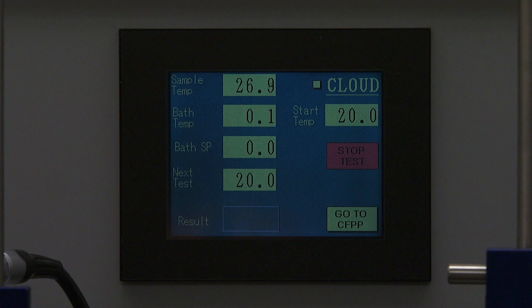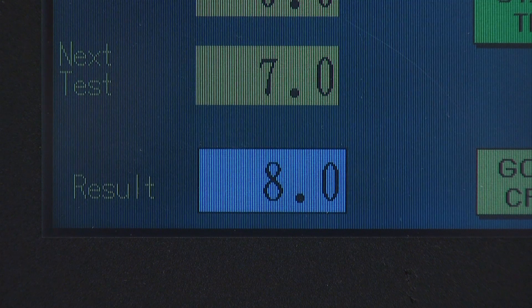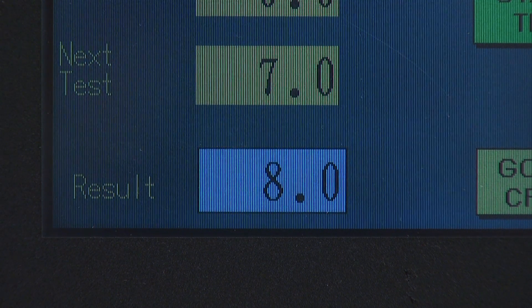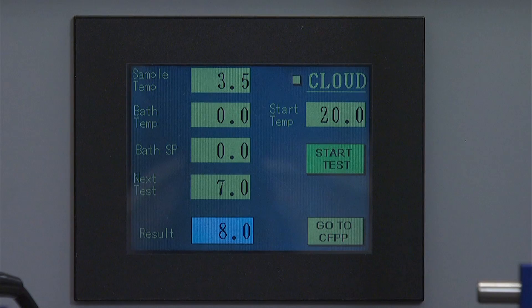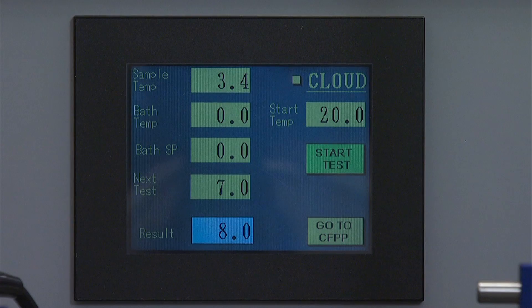Next, Test: this is the temperature at which the instrument will take its next determination. Result: this is the area where the final test result will appear. When the test is complete, the result temperature will appear in the result box and the green area marked Start Test will reappear.